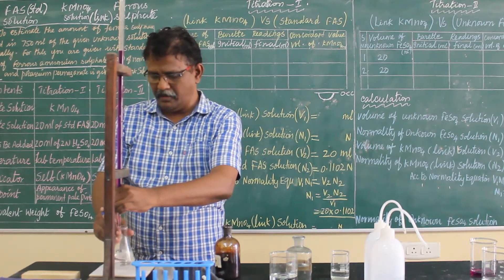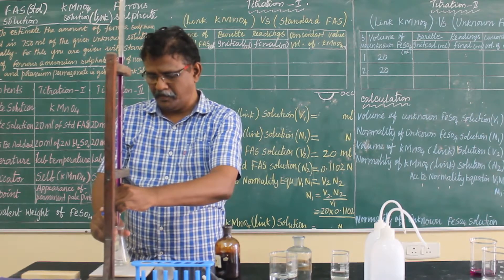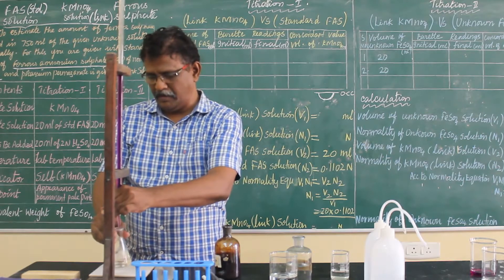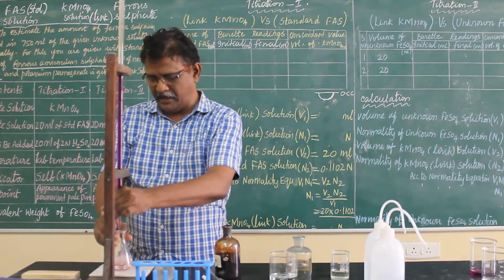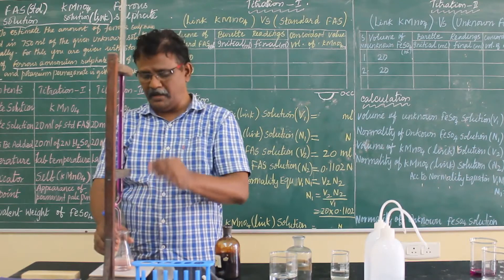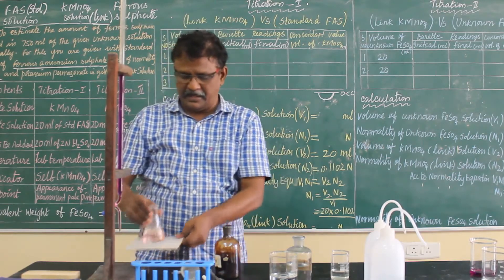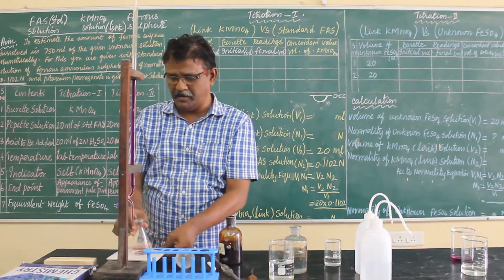Always look on the white tiles — only against the tiles can you see the pale pink color clearly. Now you are almost at the endpoint. Add carefully — yes, I got it! See, this is exactly the pale pink color. Hold it against the white background and you can see it very clearly. This pale pink color is the endpoint.